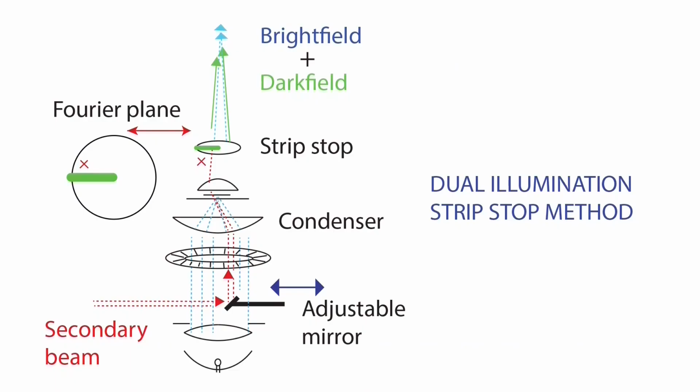We propose a novel dual illumination system that introduces a secondary beam to generate a pure dark field component, preferably in colour, which can be superimposed onto a primary bright field image. A strip stop or other mask shapes can block direct light reflected from a small adjustable mirror below the condenser. The so-called pencil beam can be aimed either to the optical axis or to other adjustable angles.